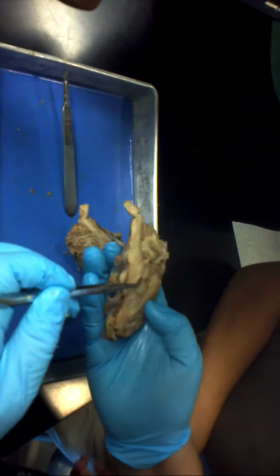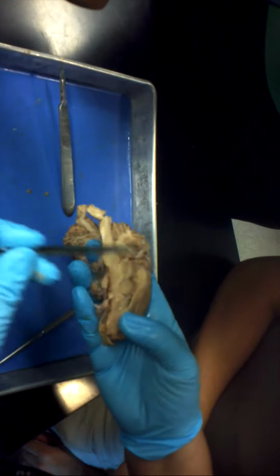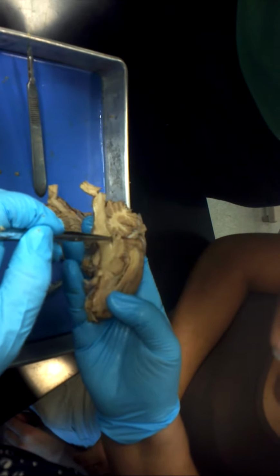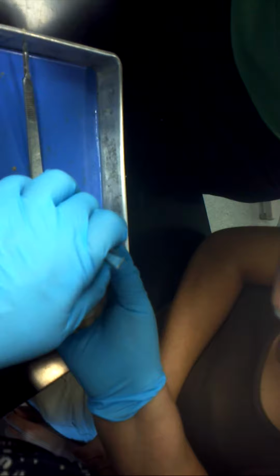Here's the lateral ventricle. This is that third ventricle you were talking about. And the fourth ventricle is down there. Yeah, this is the thalamus. This is the hypothalamus. Pituitary gland, and the optic chiasma is right here. Superior and inferior colliculi. This little groove that should run right here, let me show you, is a cerebral aqueduct, and it flows into the fourth ventricle.